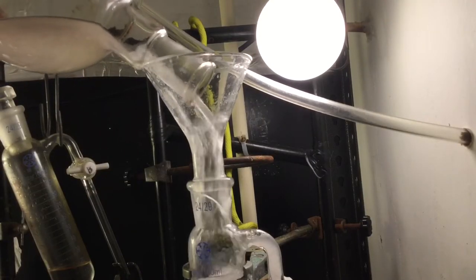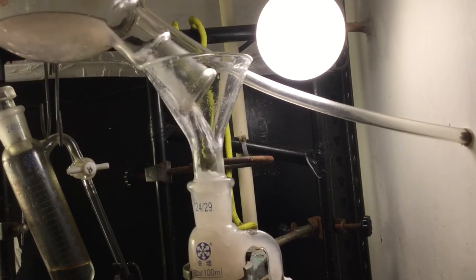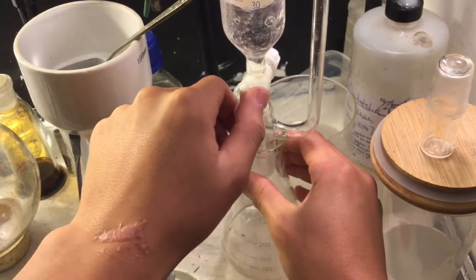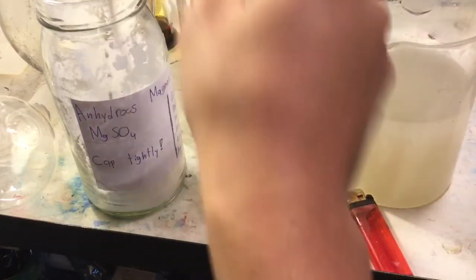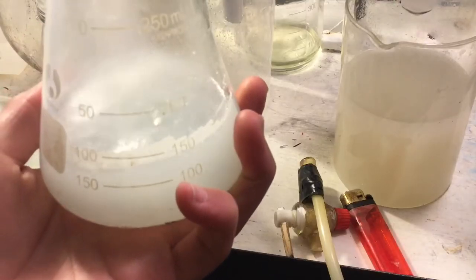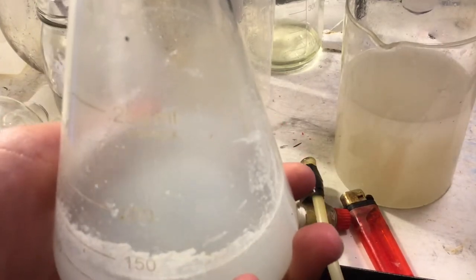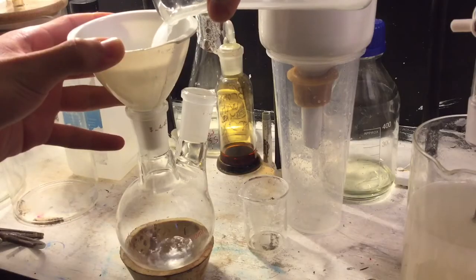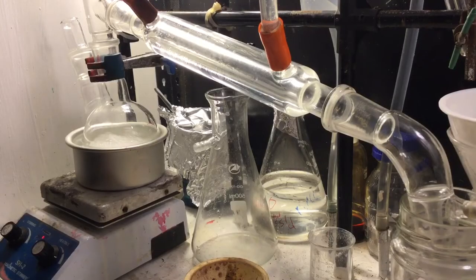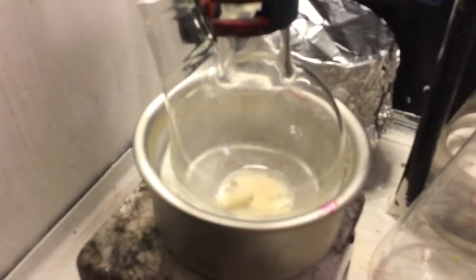Separate the chloroform layer off — that's where our lidocaine free base is. It's sort of pink colored for some reason. To this I'm going to add some anhydrous magnesium sulfate to dry it. Calcium chloride works as well but not as well as magnesium sulfate. Then filter it through a cotton ball into a flask.